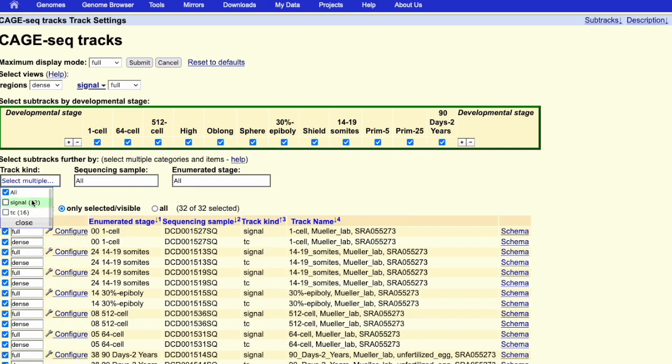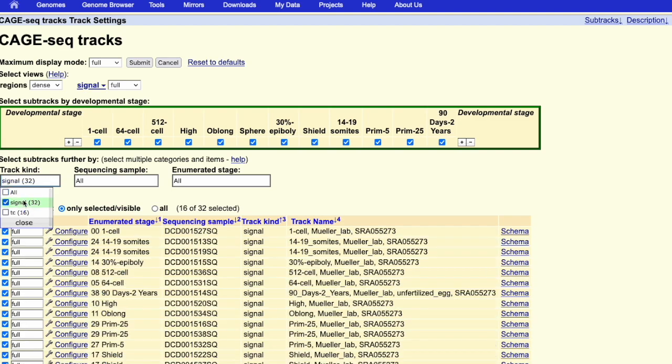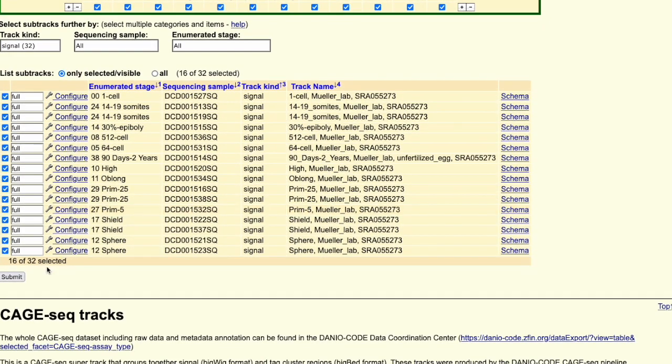The other tracks are the tag clusters, which are less useful for this specific question.